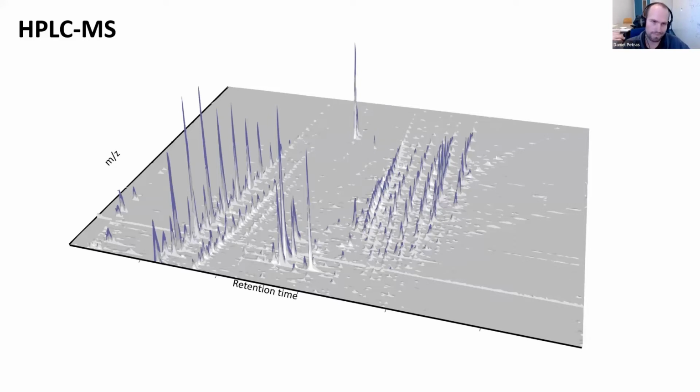Now you can maybe already calculate a molecular formula from the very accurate mass you would measure with the high-resolution instruments we have available. But that still can be a lot of different molecules or isomers that all share the same molecular formula. So I want to now introduce the next thing, which I think we mentioned already before, and this is tandem mass spectrometry.